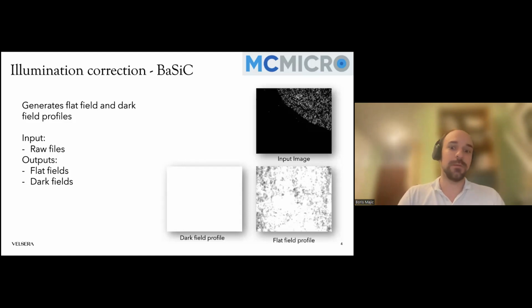Cameras which are used for microscopy are very sensitive, including to temperature. Maybe you're familiar with the fact that these cameras are cooled to minus 20 or even minus 80 degrees Celsius. I'm not sure how to translate it to Fahrenheit, sorry for my European scales. But the effects which exist from temperature being higher than 0 Kelvin manifest on our images and can impact the final results.